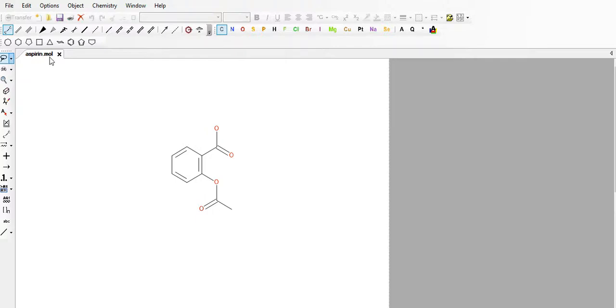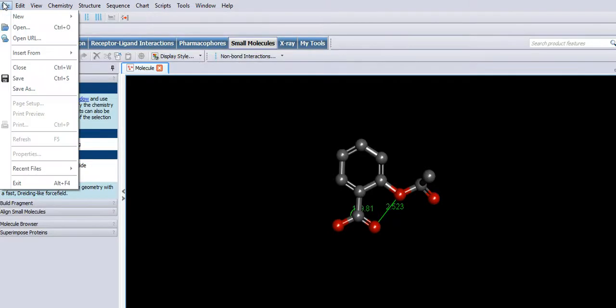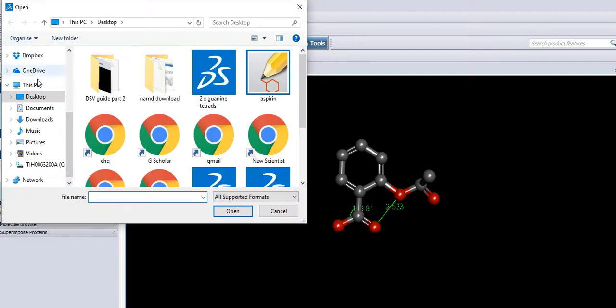Okay, you can open it up in the DSV, and there it is. That can happen sometimes with Acceleris. All the information's there but no graphic.